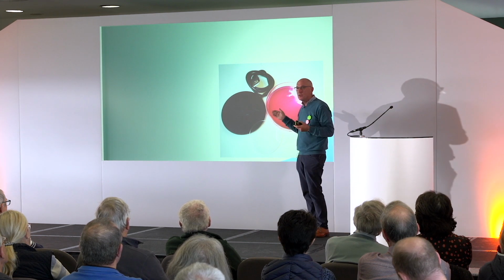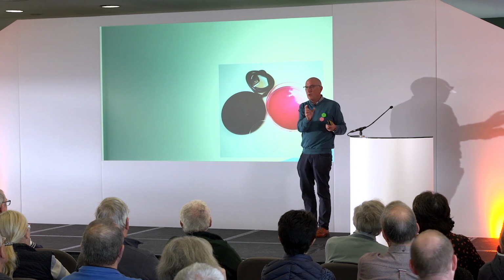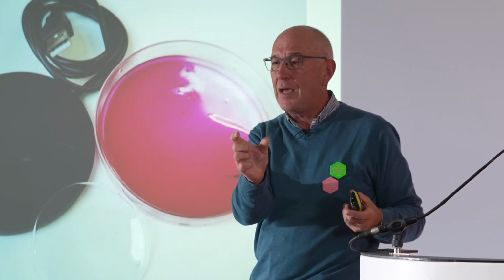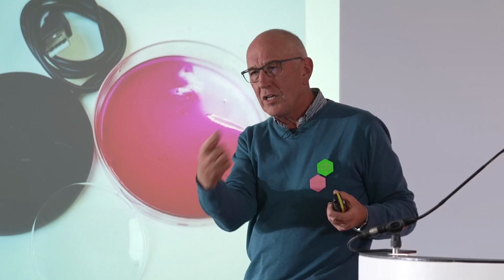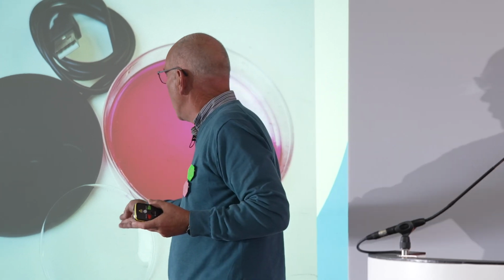But to make a simple slide to see what the pollen is, and I've got my little pouch of pollen from the squill, we're going to be good for years, because pollen lasts for years. When I come round to making my slide from that, I will just do it this way. I'll just have a watch glass.